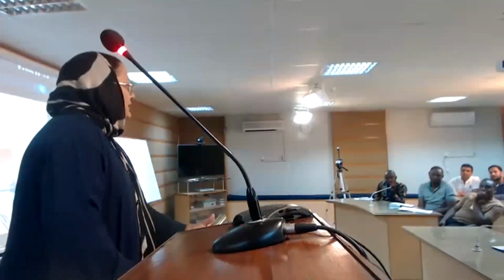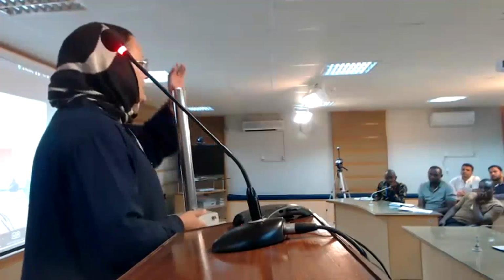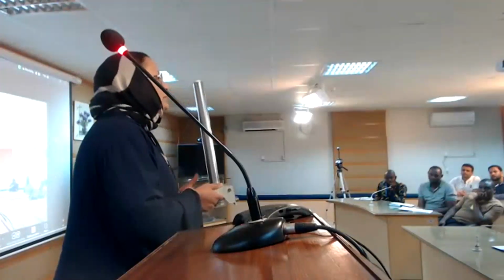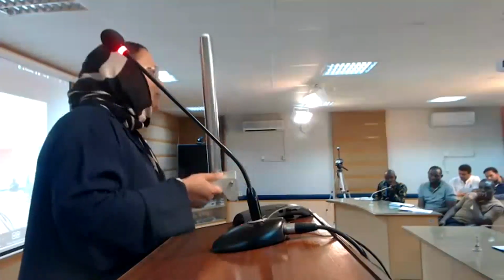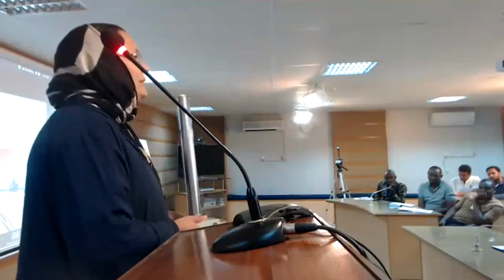So, all right, can you see this? Right. This is where your sample goes in and sits in the probe, right? But it should not be without the air bed. The air, because the air bed brings it down slowly. That's why everything that we are talking about is present here in this small probe. So it's very expensive.